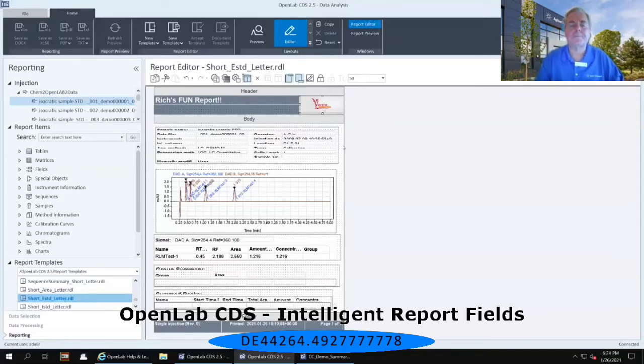They really aren't. Now, each one of those fields has a left-hand portion of the field and a right-hand portion of the field. On the left-hand portion of the field, if you double-click that very first field and the left-hand portion of it, it says sample name. But if I double-click on it, it highlights sample name all in a blue hue or in a blue background color. I can now type in a different label if I wish. The left-hand portion of a field is called a label, and that's fully editable. So I can type in sample in all uppercase.